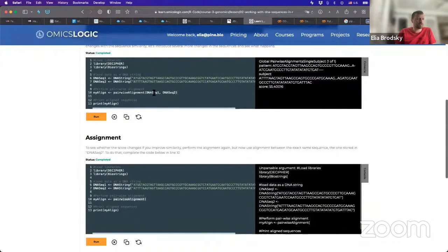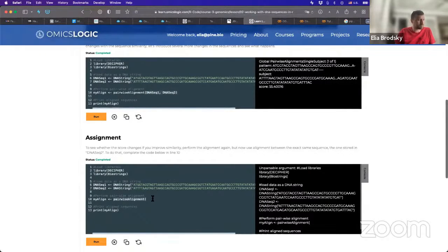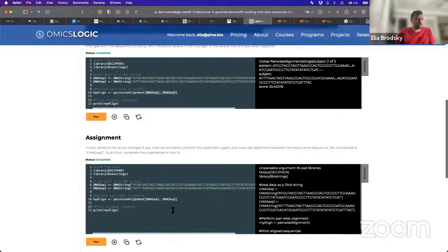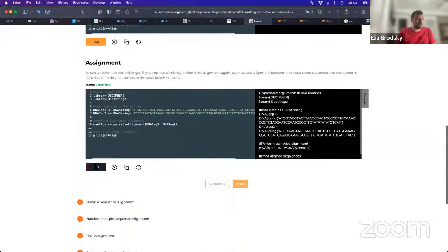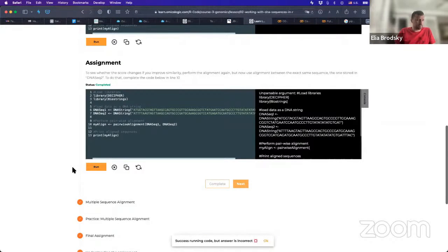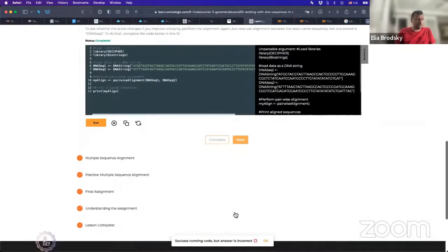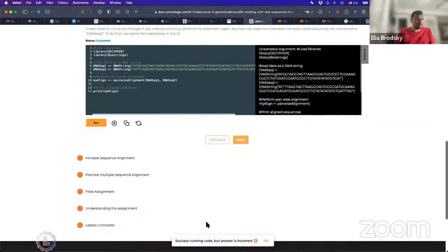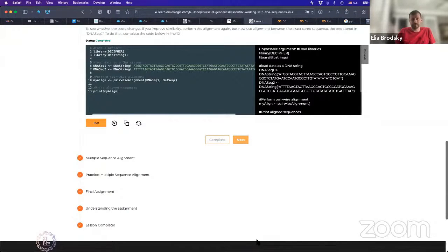Pairwise alignment should be dna-seq1, dna-seq2. Right? So we can just copy it from here, paste it over here. And if I run it, what will happen? I will get a result, but my result is the answer is incorrect. Okay?